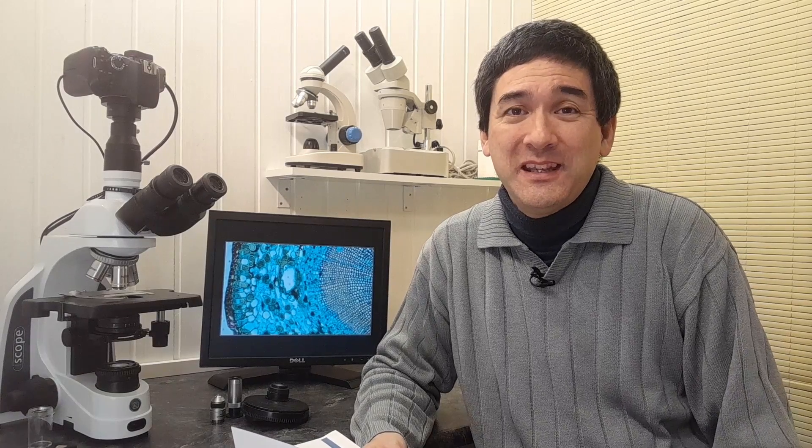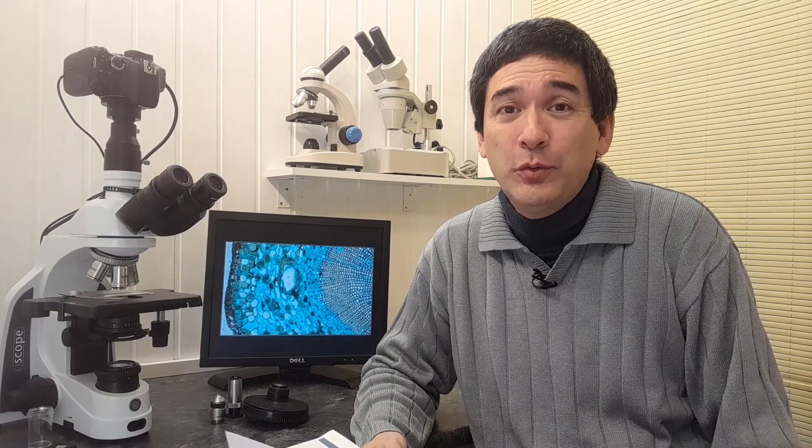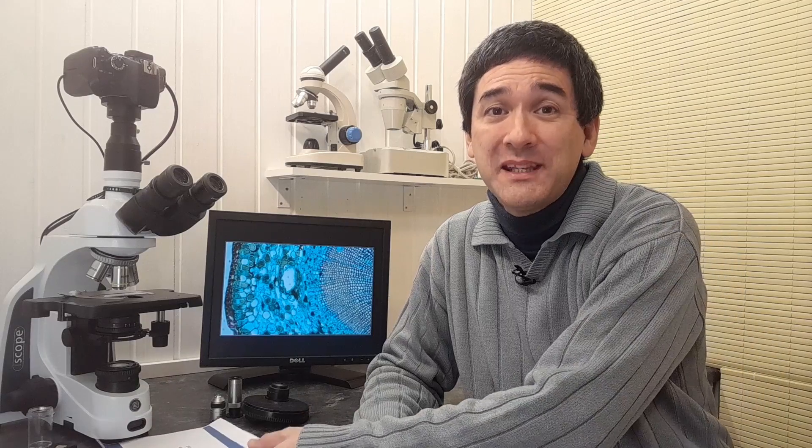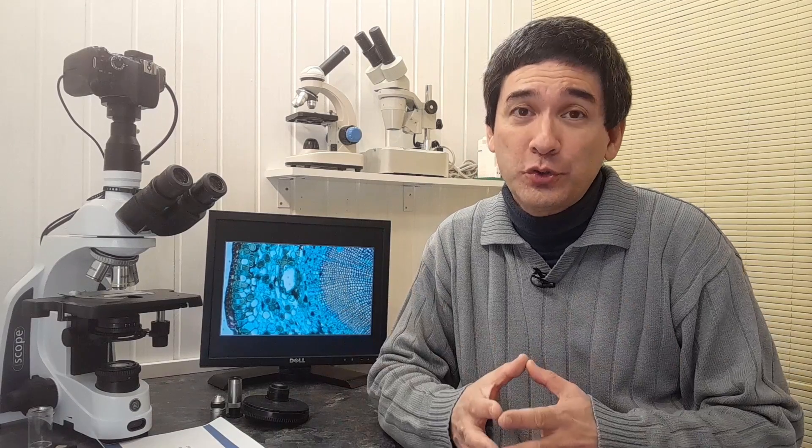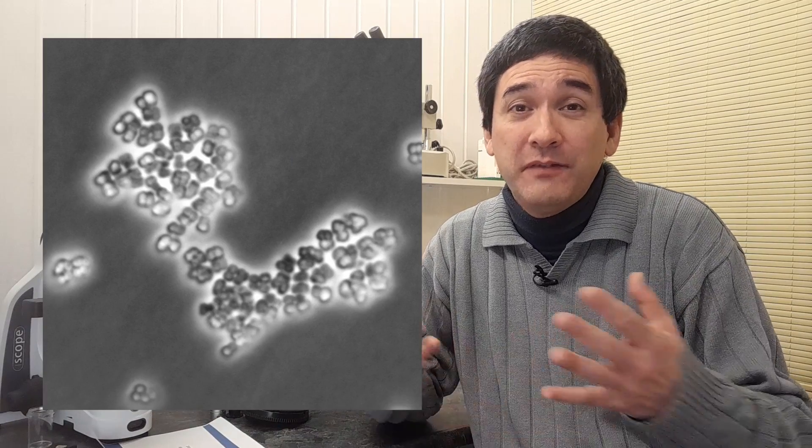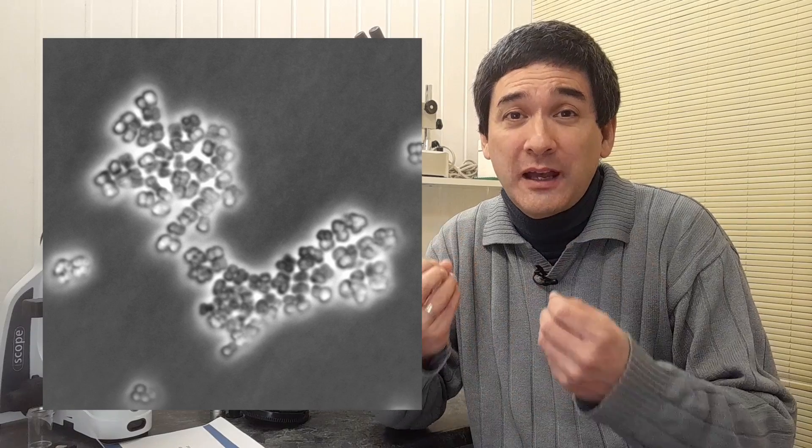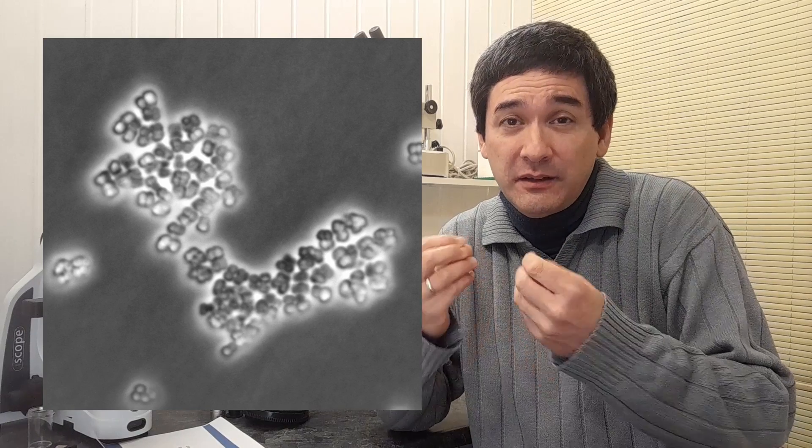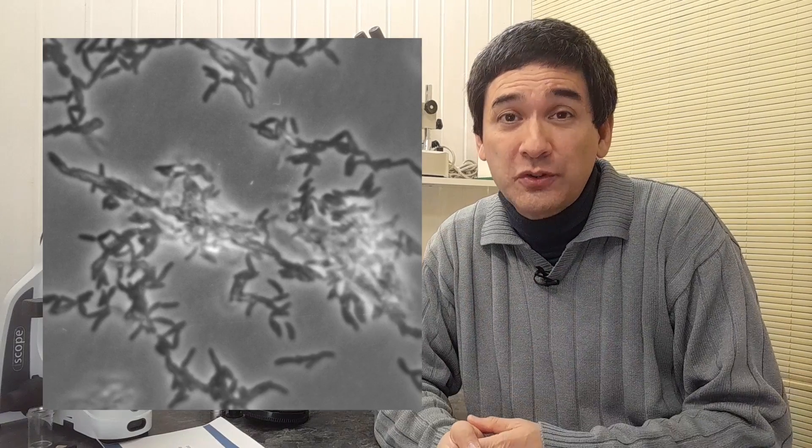Phase contrast microscopy is a slightly more advanced technique which allows you to see specimens that are of very low contrast, for example bacteria, very thin. If they do not have enough pigment, then they're very thin and it can be very difficult to see.